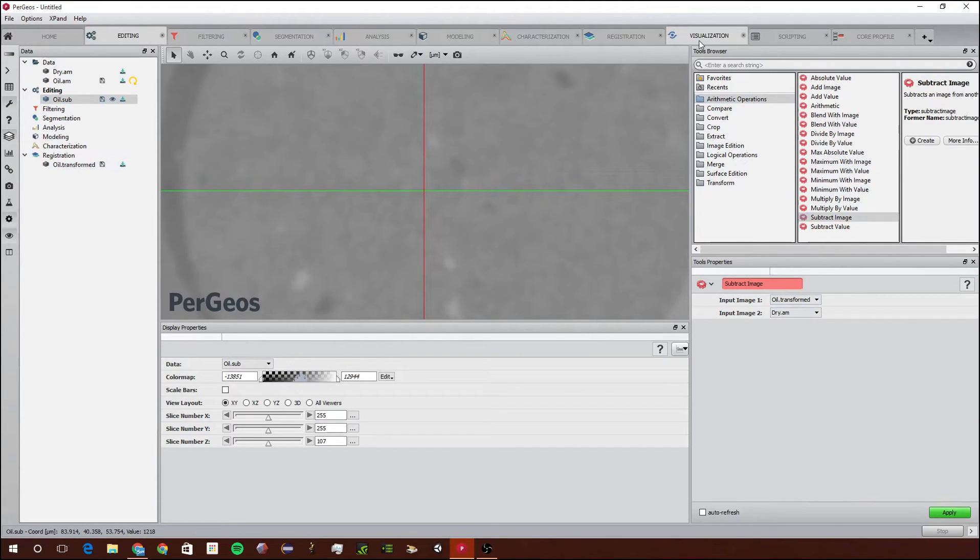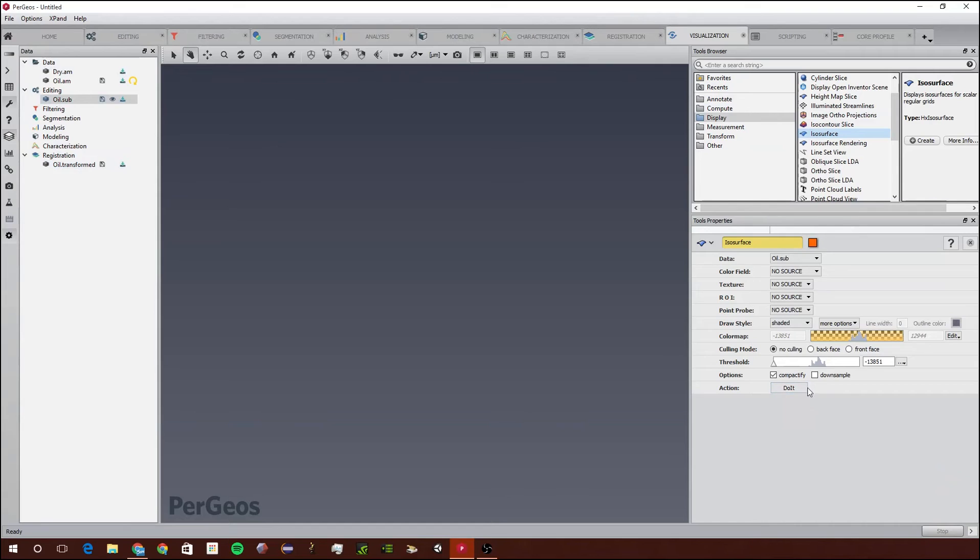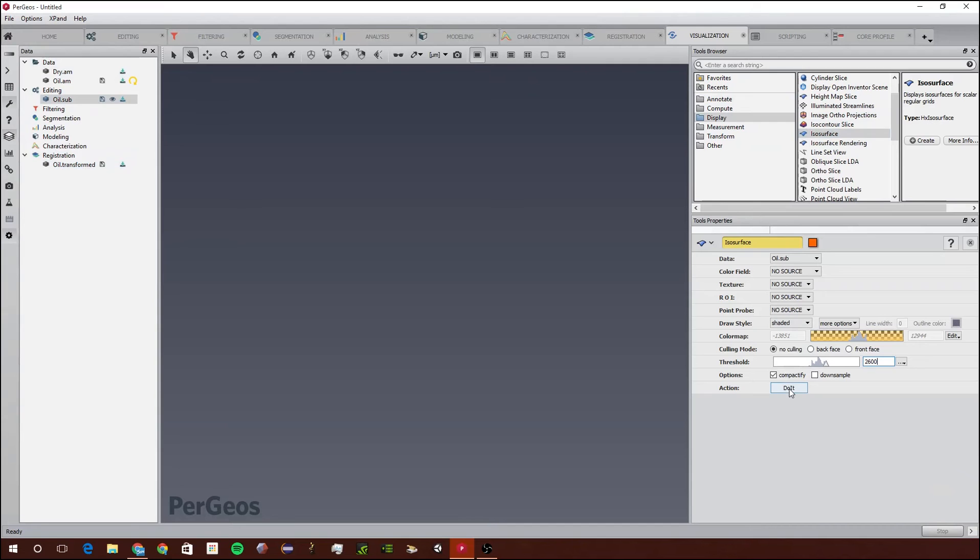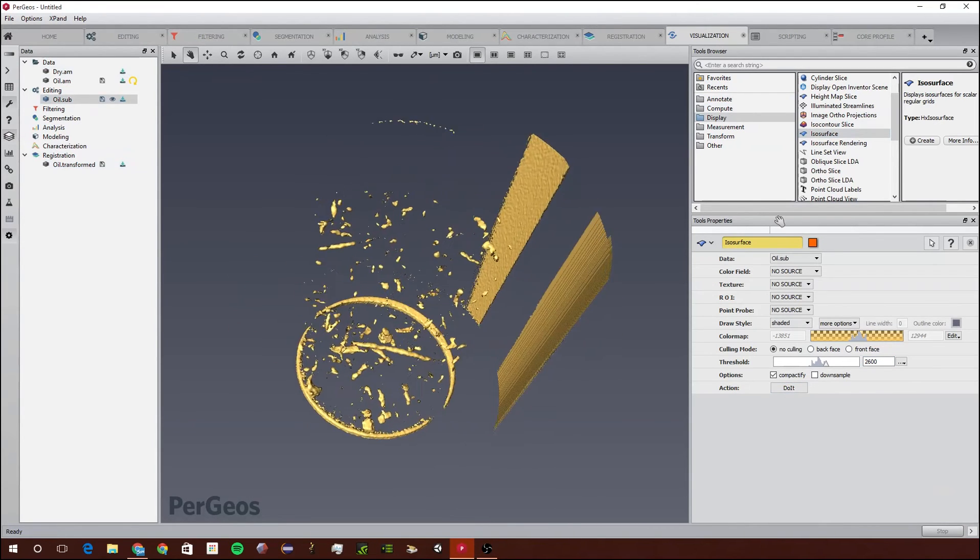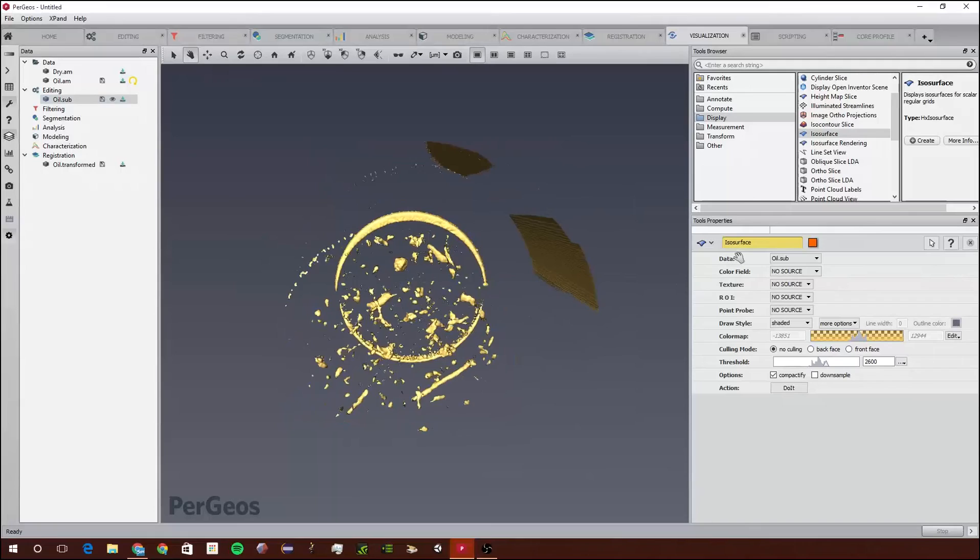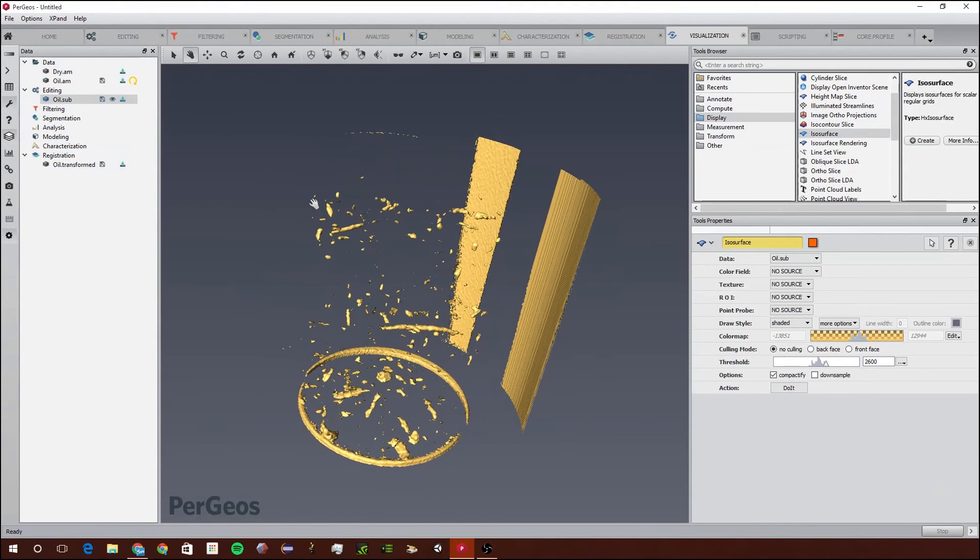Next we're going to jump right over to the Visualization Workspace. We're going to go to Display and ISO Surface, and double click on that. For this threshold we're going to type in that number we found, so for me it's around 2600, and we're just going to click Do It. As you can see, it's a 3D representation of all the pores that are now filled.